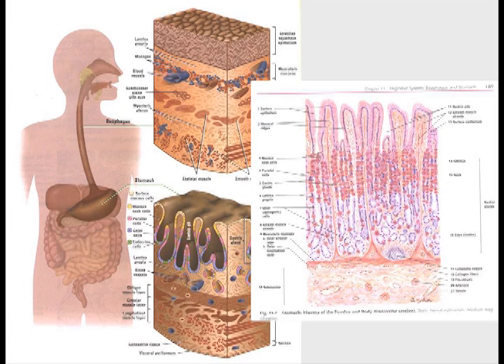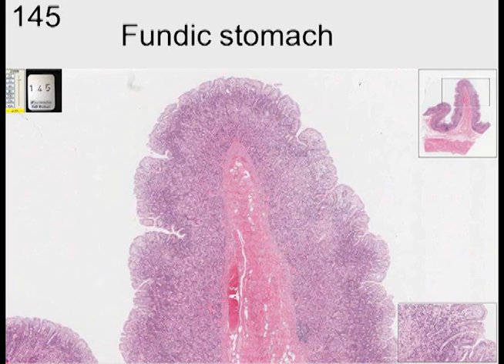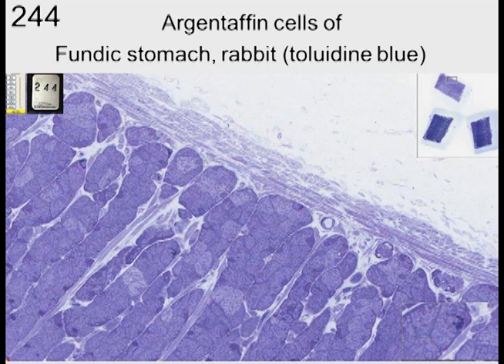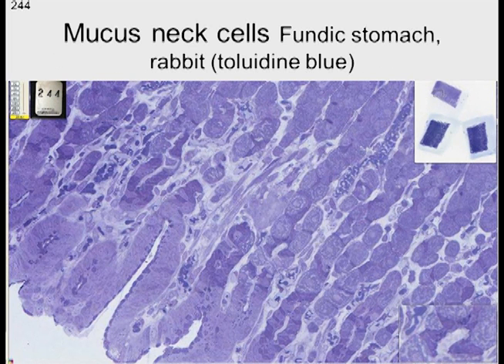This is another view from an atlas of the digestive tract. It starts out with the trachea, the esophagus, and then from the esophagus it goes to the stomach — so you have stratified squamous epithelium in the beginning and then simple columnar. Here we see slide 145, which has the fundic stomach. Inside there, you can see some big cells with light-staining cytoplasm and a spherical nucleus — those are the parietal cells. The ones shaped like columns are chief cells, which produce pepsinogen, and the pyramid-shaped one is a parietal cell producing hydrochloric acid. In the fundic stomach of a rabbit, you can see the parietal cells have a host of mitochondria around them, and on the surface we have the surface mucous cells as well.